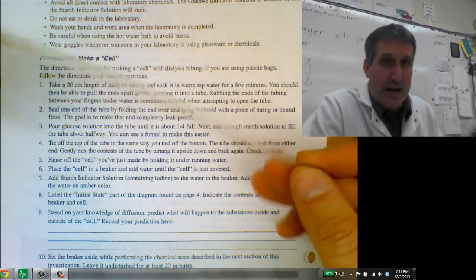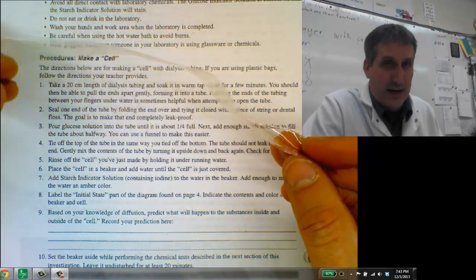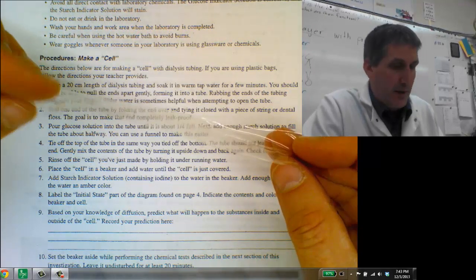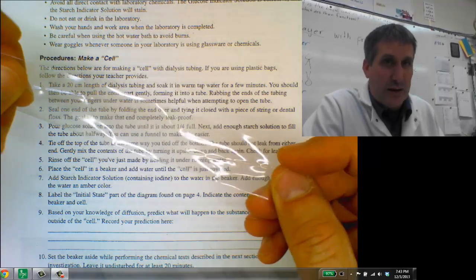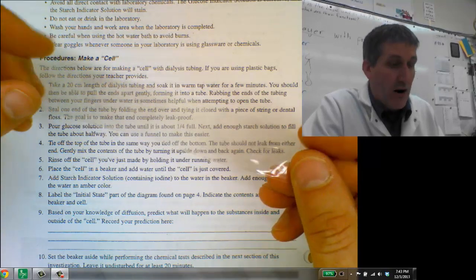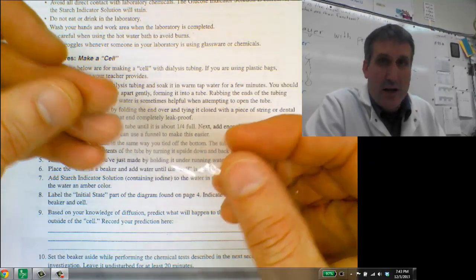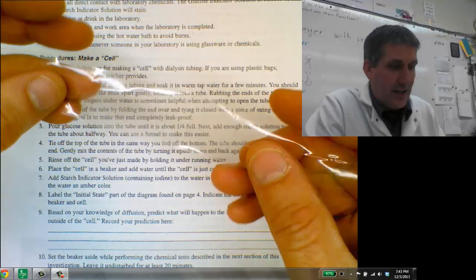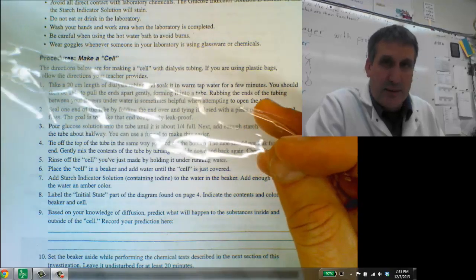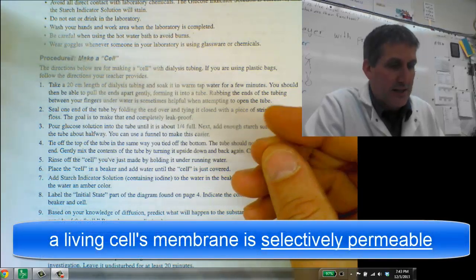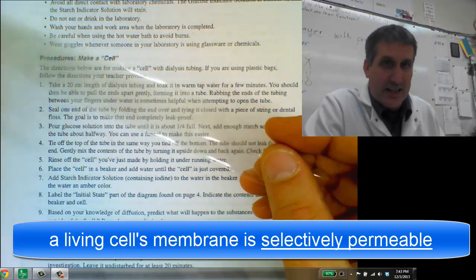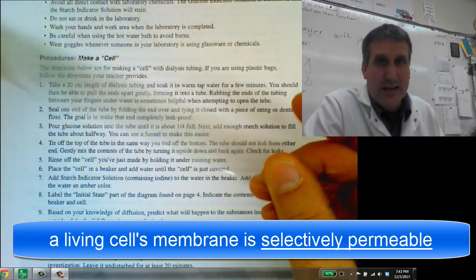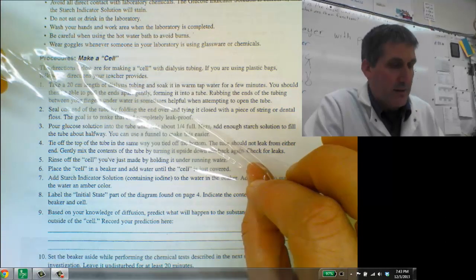Now this is a fixed membrane, unlike a real cell membrane which can change its permeability. This dialysis tubing has a fixed permeability. There are microscopic holes in here, but they are a fixed size. They do not change. So that's a little bit different than an actual living cell, which does have some control and can actually change its permeability. This dialysis tubing is a fixed membrane.